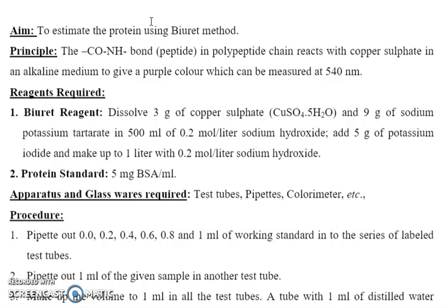The reagent required is the Biuret reagent. Dissolve 3 gram of copper sulfate and 9 gram of sodium potassium tartrate.